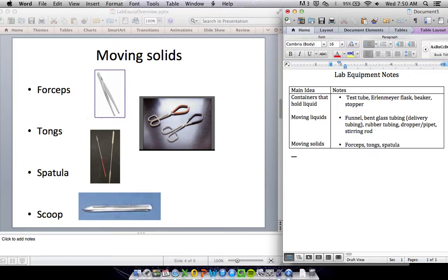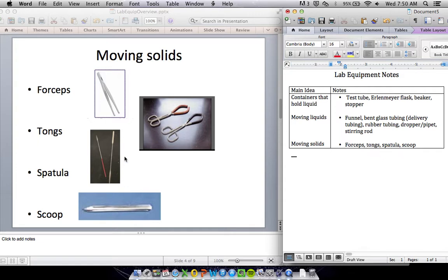A spatula may look a little different than the spatula at home. And then a scoop. Those are both used for moving small amounts of powdered chemicals.